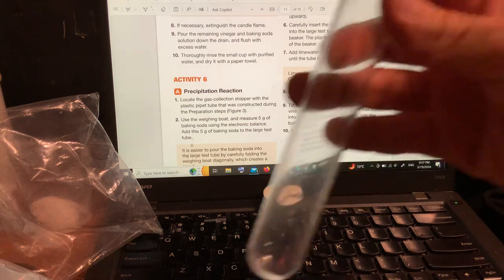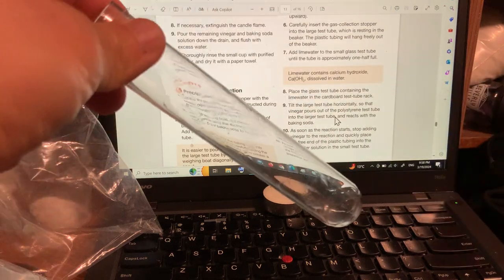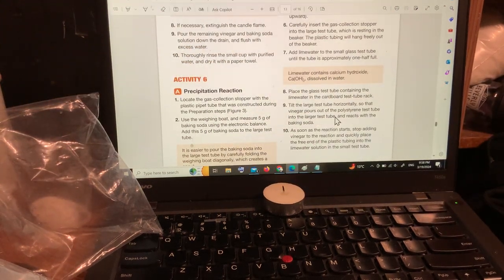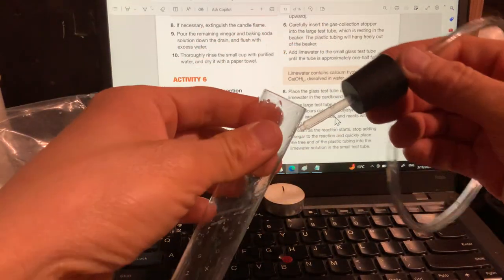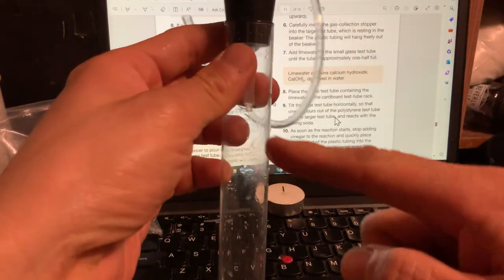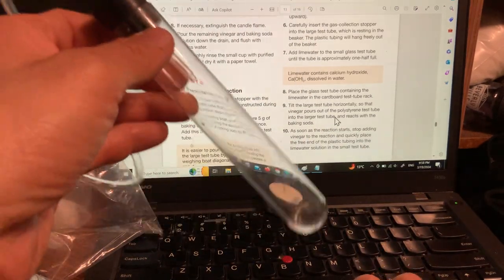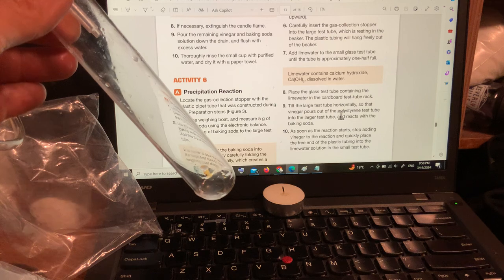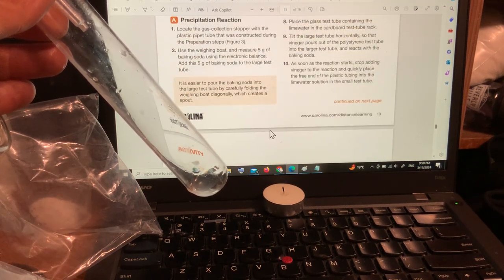Okay. Now this does not have to be dry. You do not need to dry. It just has to be clean, not dry. Okay. That's pretty clean. Okay. Now put the gas collection stopper, it goes on here, right? But we're going to make some gas in here. We're going to make carbon dioxide gas. I believe we're going to use baking soda and vinegar again to make this carbon dioxide gas.